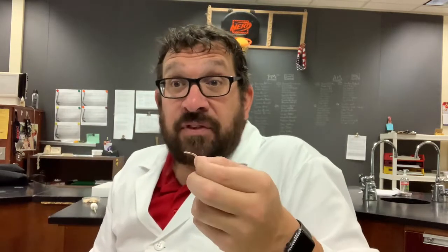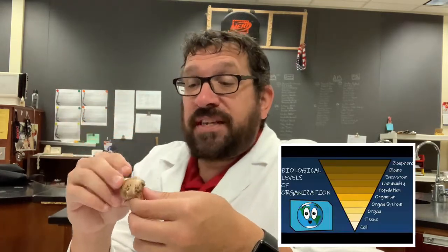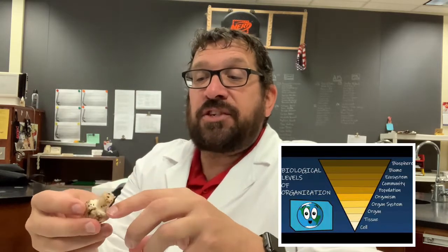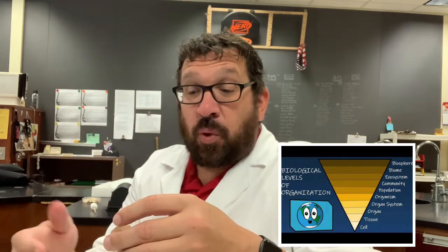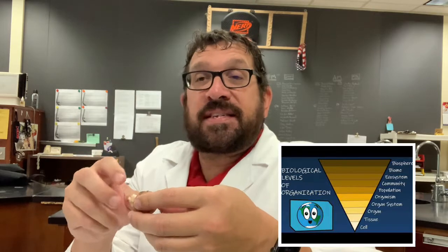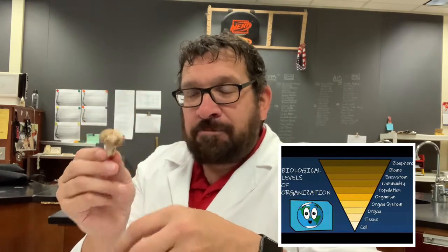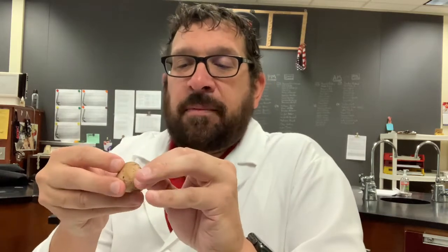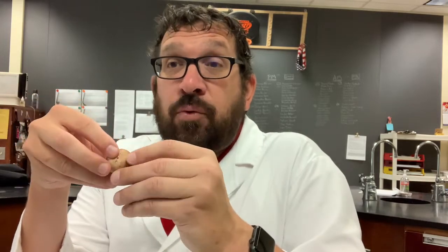These organisms have tissue. They're made up of all those different levels that we talked about before. There are cells inside this mushroom. Those cells make up the different tissues. We've got the tissue around the bottom called the veil, the tissue that covers the top of the cap. Those tissues working together make up the different parts, the cap, the stem, the gills inside. Those are all organs. And then finally we get to our organ system of all those parts working together to make the organism. So I'm going to peel off some of this tissue and see if I can get a nice thin piece that is transparent enough to be seen through the microscope. Let's see if we can make this happen.